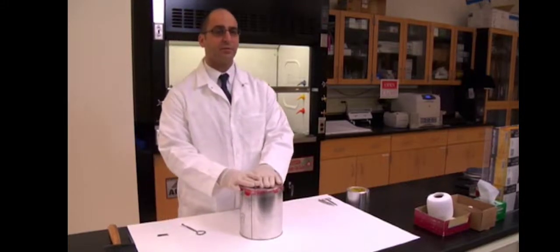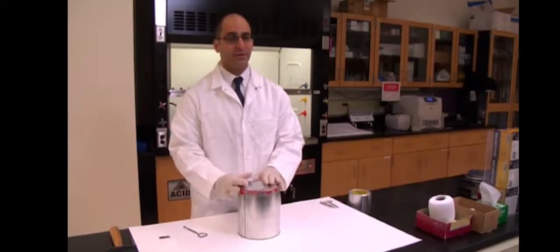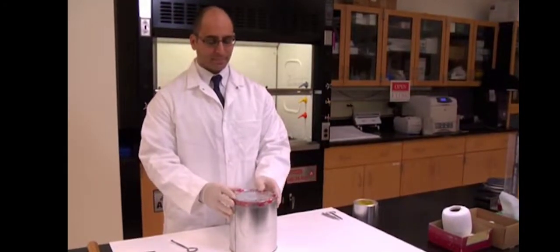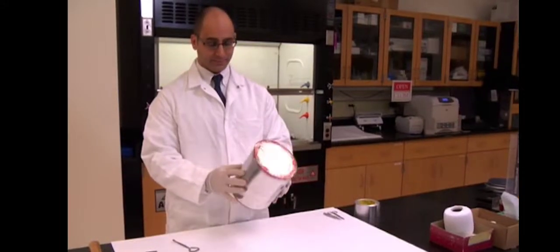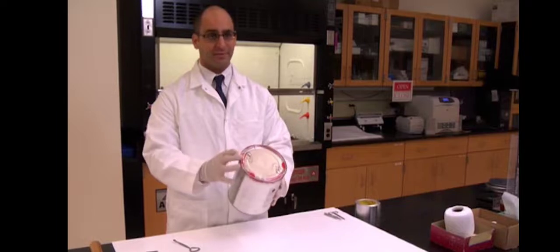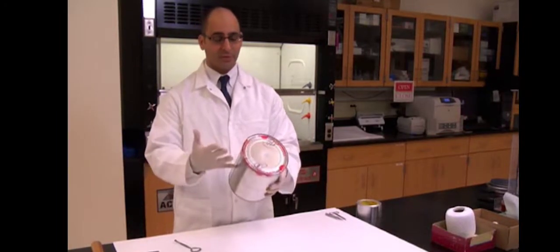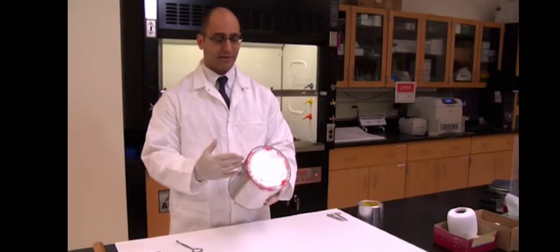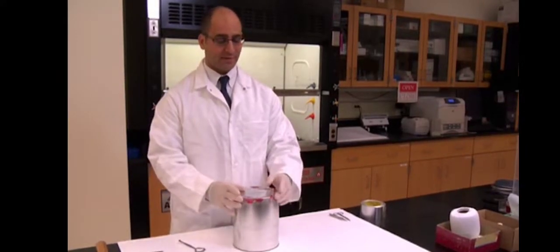One of the things that we need to do with fire debris analysis is look for ignitable liquid residues. And ignitable liquid residues tend to be volatile organic mixtures. Once this is all sealed up, I would take this can, put it in the oven, heat it up, and then any volatile compounds would go into what's called the headspace above the sample. This is why it's important not to overstuff the cans. If you put too much material in the can, there is no headspace, and you won't be able to get those volatile components into any headspace that would be there, so you wouldn't be able to do your sample analysis.